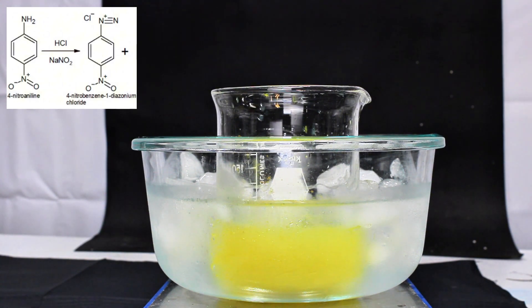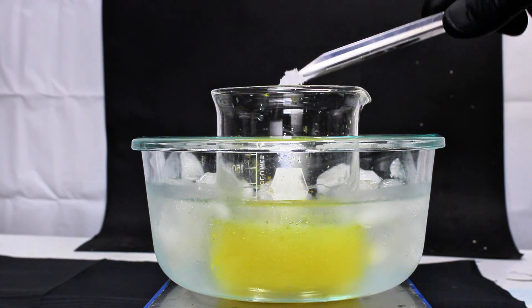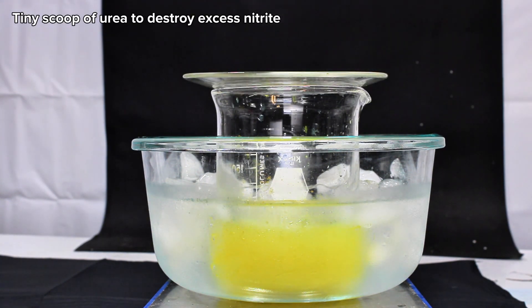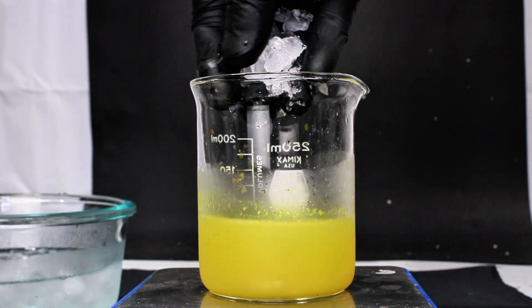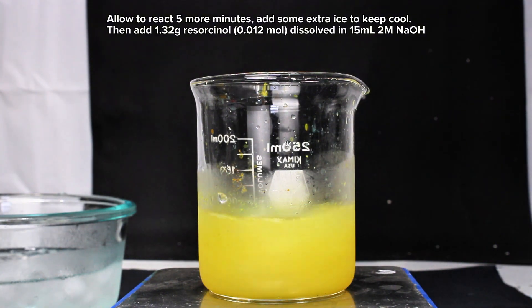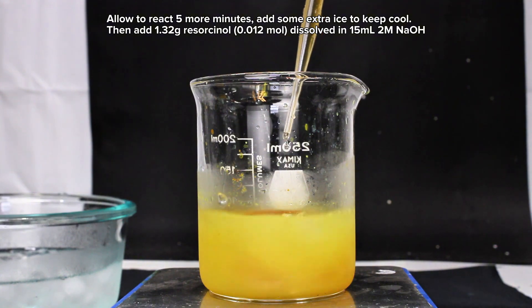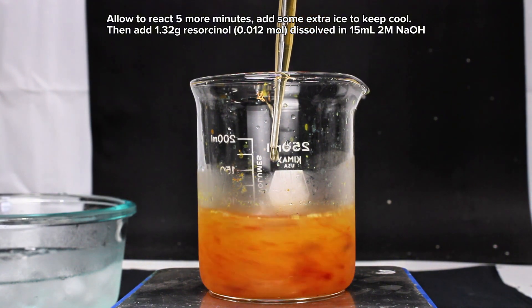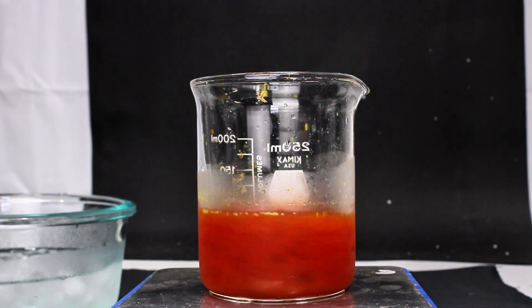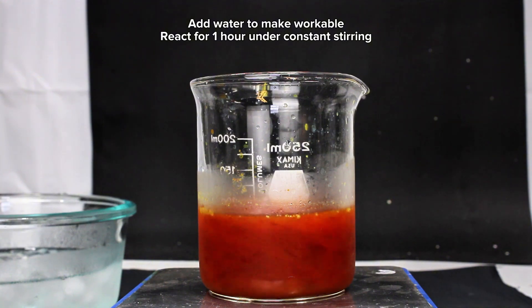Hope I said that right. And this is our intermediate product. Once this mixture has had about 15 minutes to sit and react, I went ahead and added around a quarter gram of urea to destroy any excess nitrite. This is allowed to react for another 5 minutes before slowly adding 1.32 grams of resorcinol dissolved in 15 milliliters of 2 molar sodium hydroxide. The moment the resorcinol comes in contact with the diazonium salt, the two will immediately react forming a dense red precipitate of our product, Azo Violet.